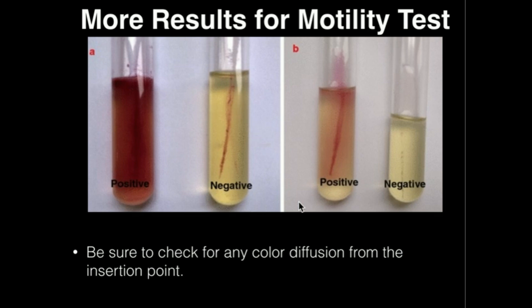Now, if you looked at this third tube initially you might say that's a negative result, but it is actually a positive result. Even though the red is not as obvious as the left tube, we do see some red diffusion away from the stab, meaning the bacteria were actually able to move away from the inoculating needle. Therefore this is a positive result. When we classify something as non-motile, there can't be any red diffusion — none at all — away from the stab. If it's a lot or even just a little, it's going to be a positive result for motility.